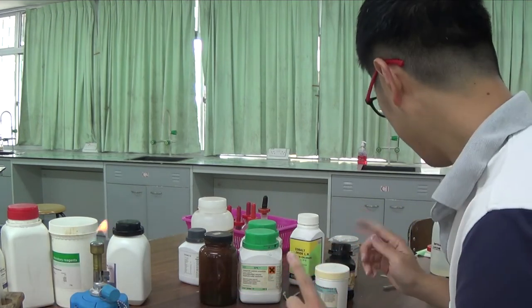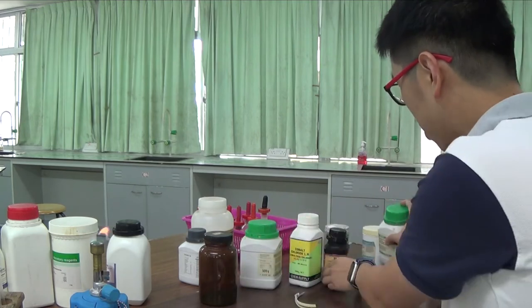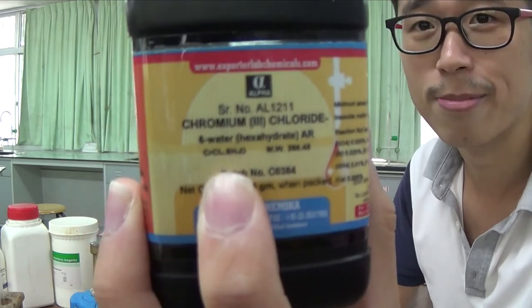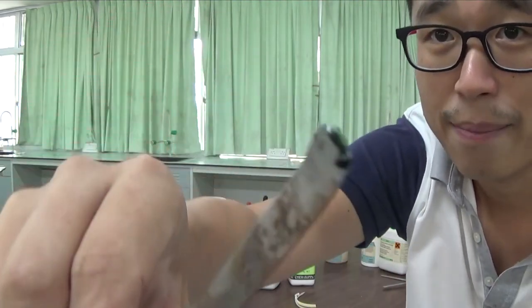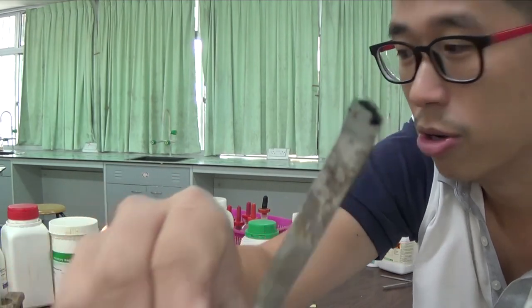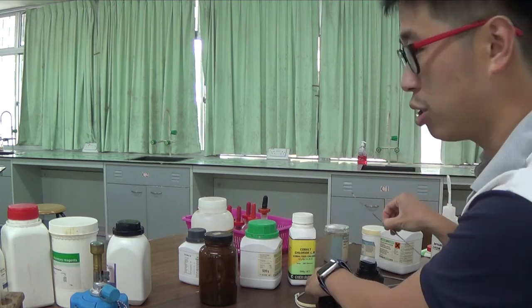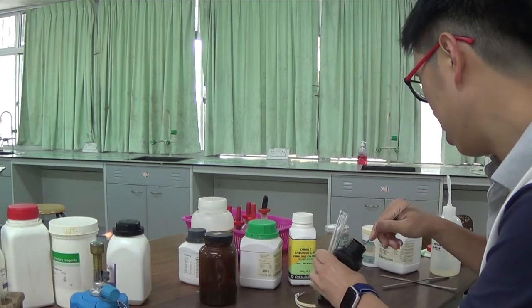Okay. Should I do one more? Maybe I just do one more. Okay. So this was the chromium 3 chloride just now. Alright? And I had my test tubes. I had my spatula just now that has a little bit of chromium 3 chloride in there. It's gone a bit liquidish because of the water crystallization. Anyway, I'll take out a little bit of it.